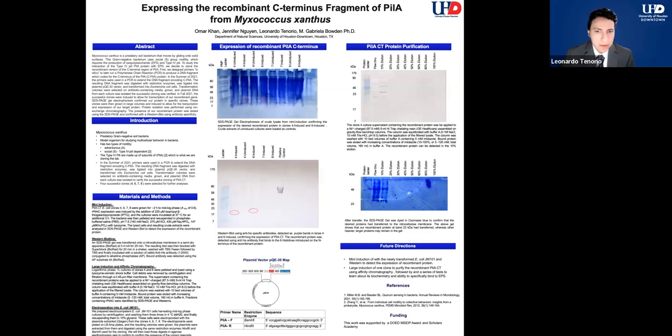So then we moved to the electroporation into the E. coli JM101 strain. So considering the results, we prepared electrocompetent cells of E. coli JM101 by harvesting mid-log phase cultures through centrifugation and washing them 3 times with double distilled water at 4 degrees Celsius. We then resuspended the culture in 10% glycerol.